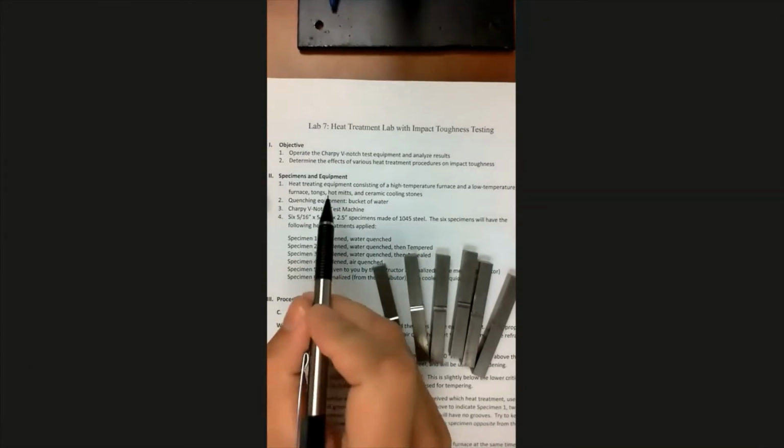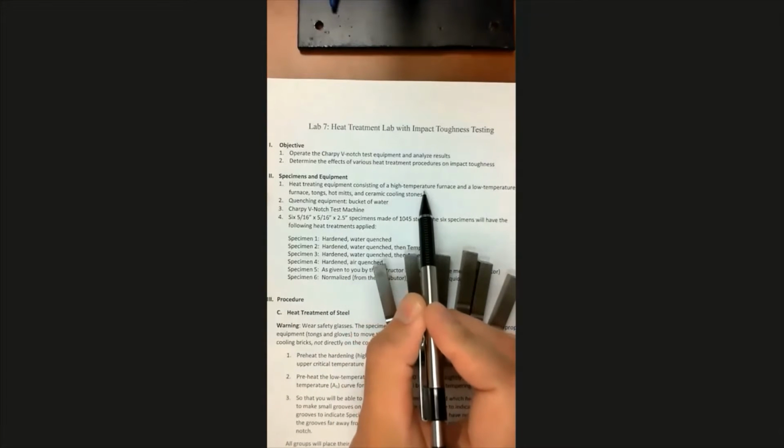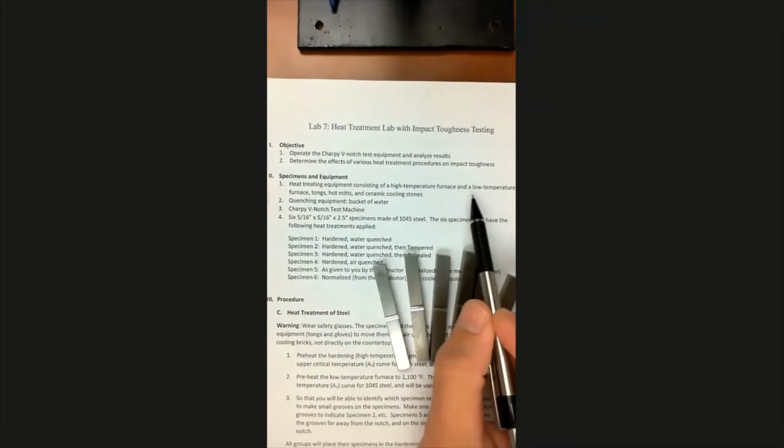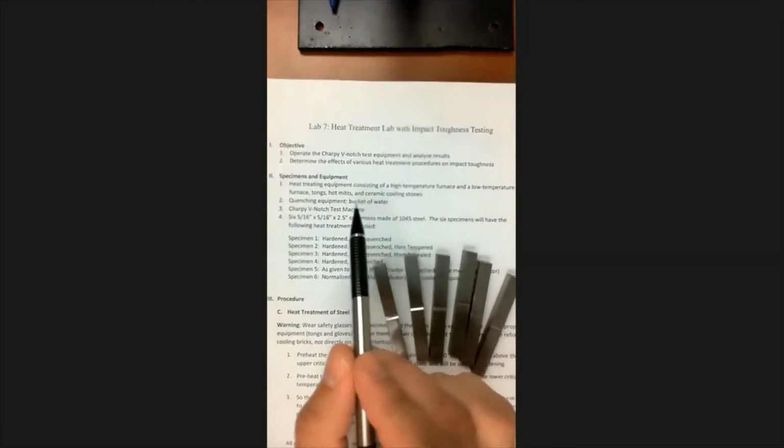To do this lab, we're going to need two furnaces. One's going to be at a higher temperature above the upper critical temperature for this steel, and one's going to be below the lower critical temperature. So we're going to have a high temperature furnace and a low temperature furnace. They take a couple of hours to heat up to these really high temperatures. This is not like cooking a pizza at 350 or 400 degrees Fahrenheit. These are going to be a lot hotter than that. So it takes a little while to let these warm up.